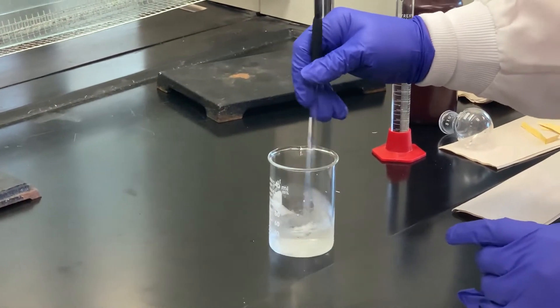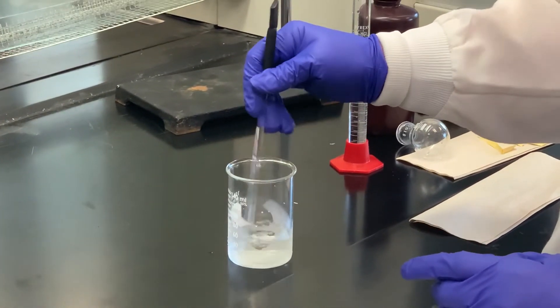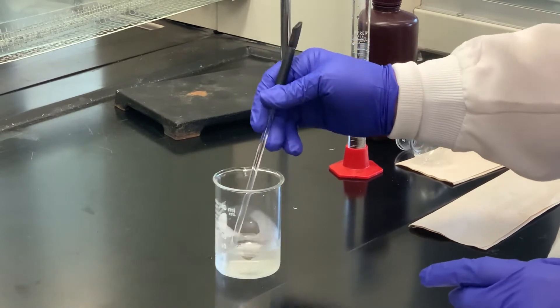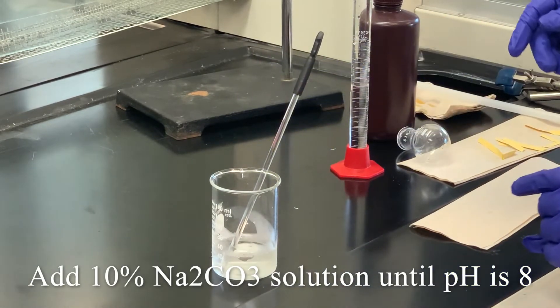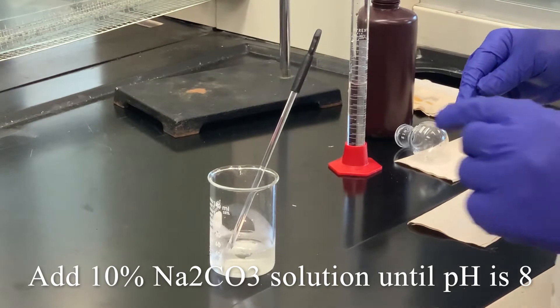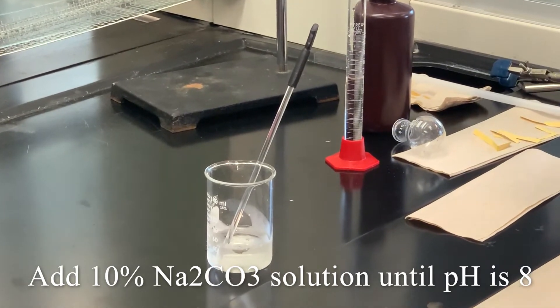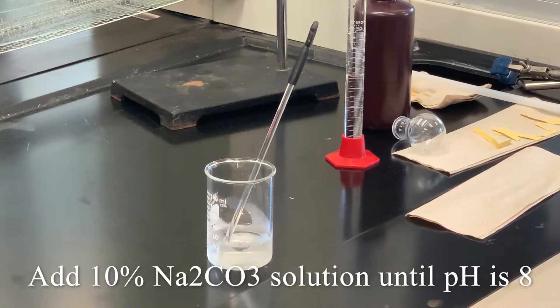Then what I'm going to do is add 10% sodium carbonate until we get a pH of around 8. At that point, the benzocaine should precipitate, and once it precipitates, then we can collect it by vacuum filtration.